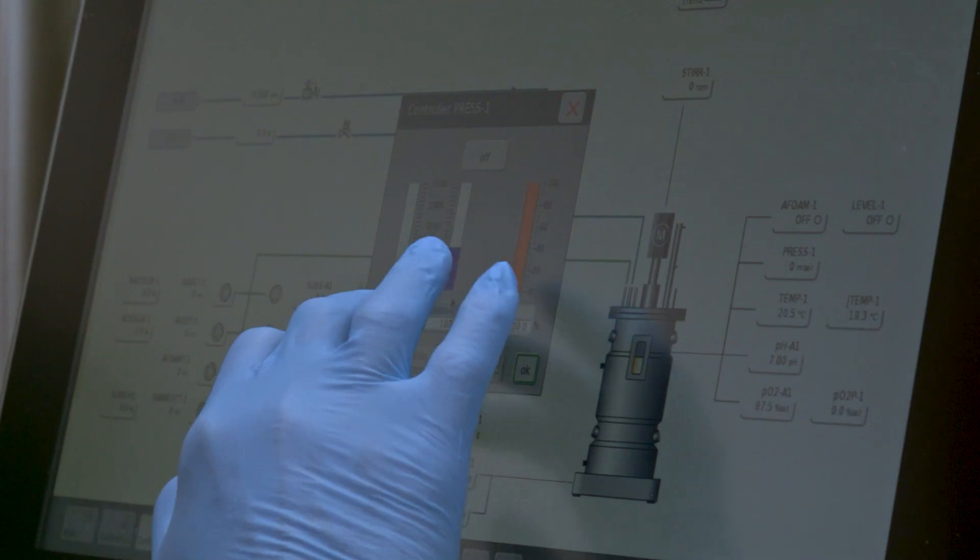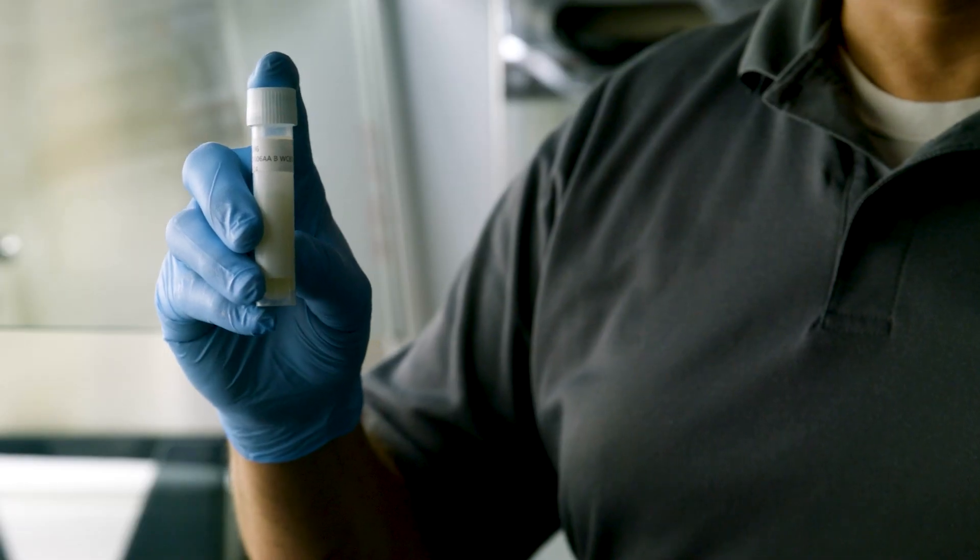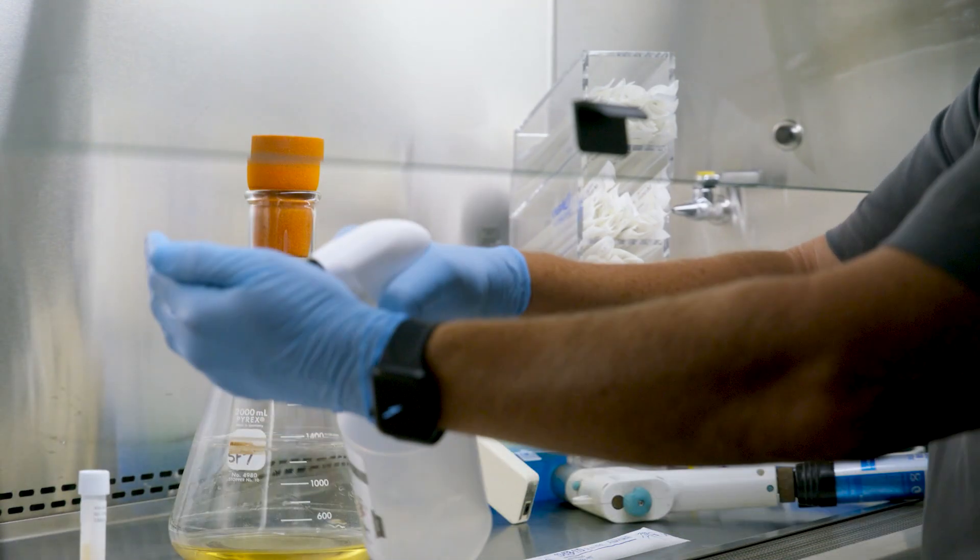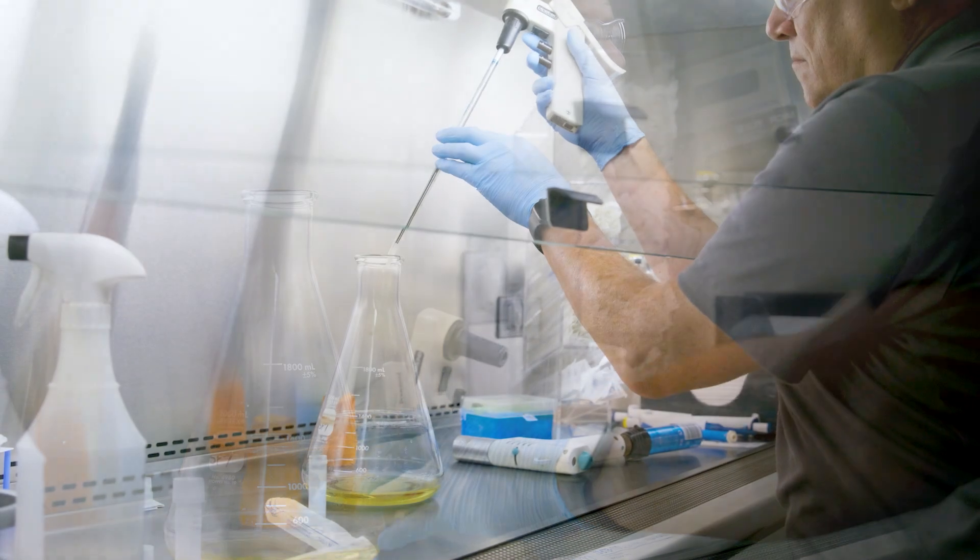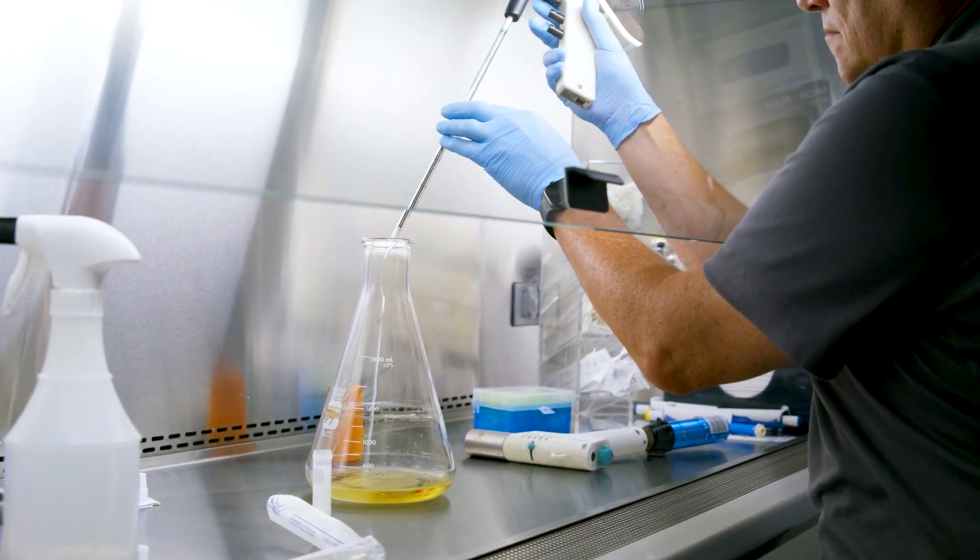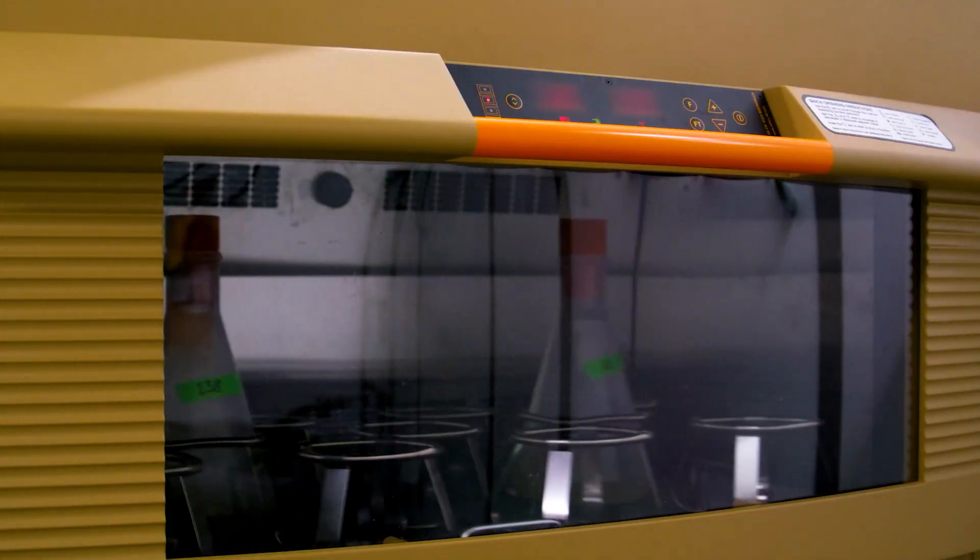In the microlab, we take a very small amount of cells in a cryo cap, take it out of the minus 80 freezer, let it come up to room temperature, and then we inoculate those cells into a shake flask, a very nutrient-rich medium.